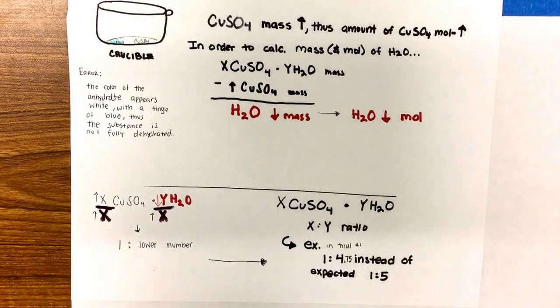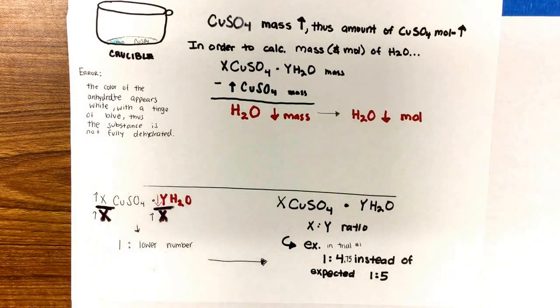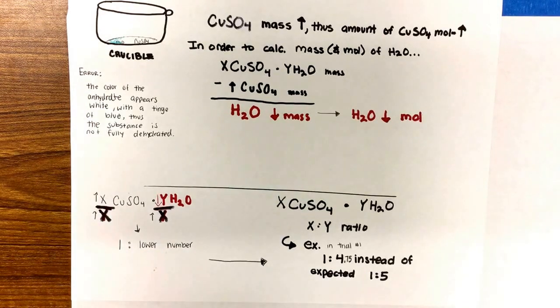In the hydrate lab, we noticed in trial one there was a 1 to 4.75 ratio for the CuSO4 to hydrate ratio when it should be the expected 1 to 5 ratio. This can be concluded because a student could have perceived a tinged blue-white substance to be fully dehydrated when in fact it was not.